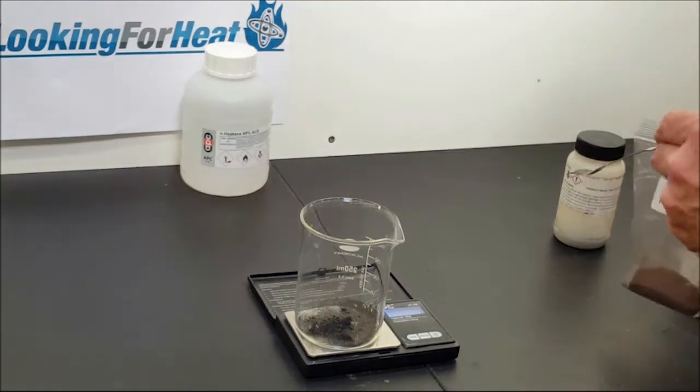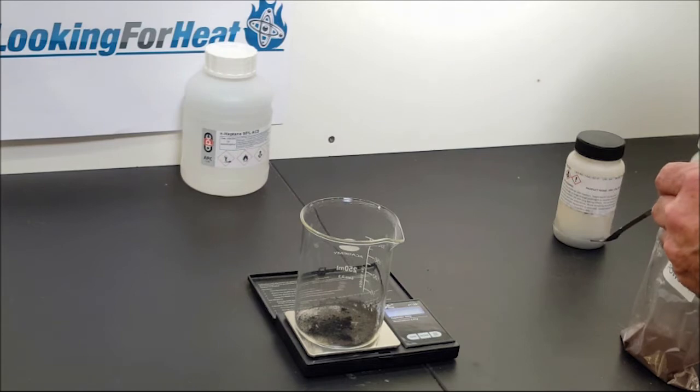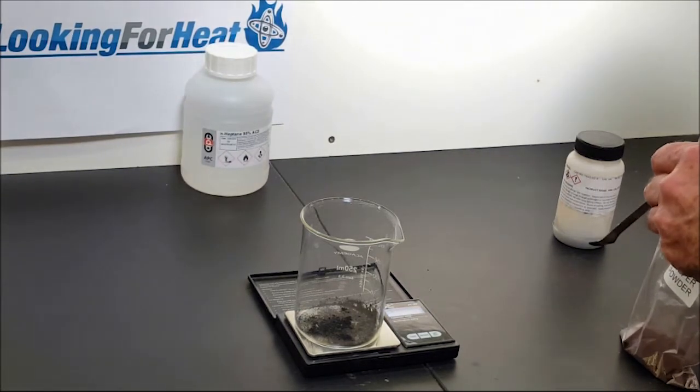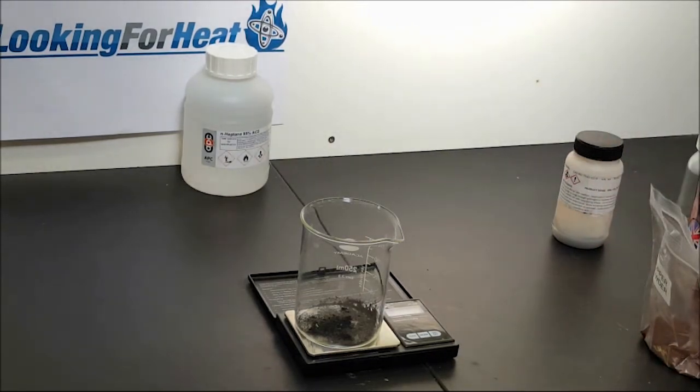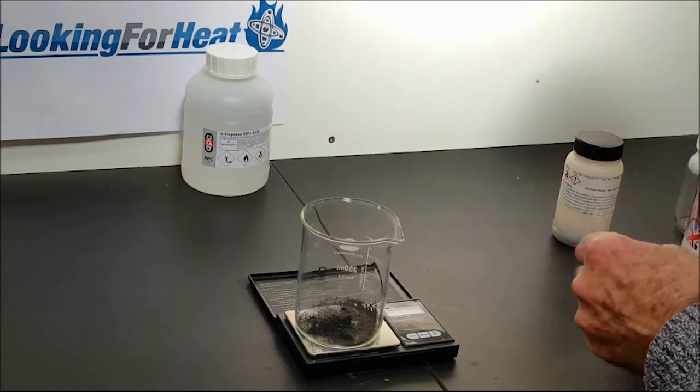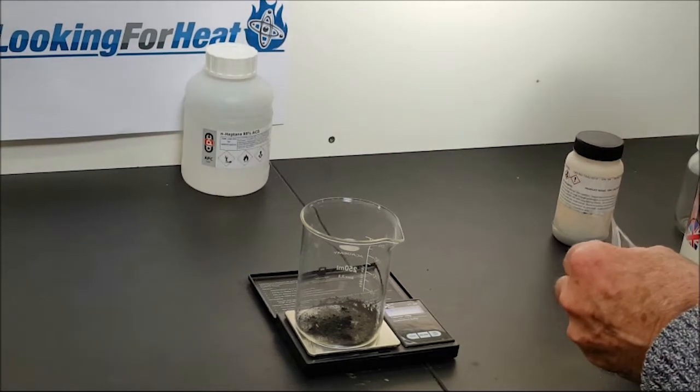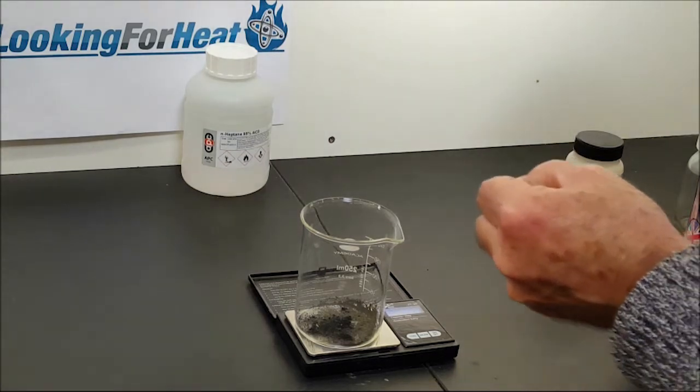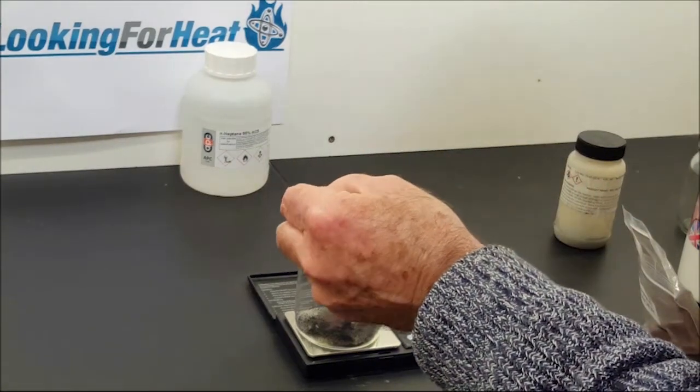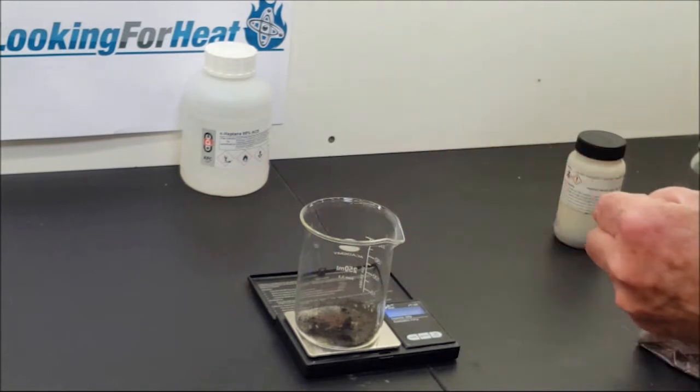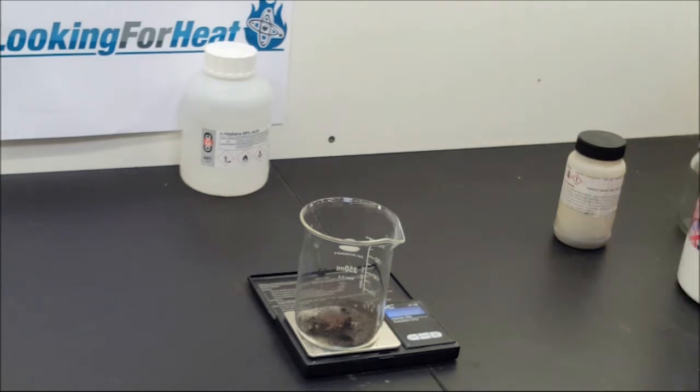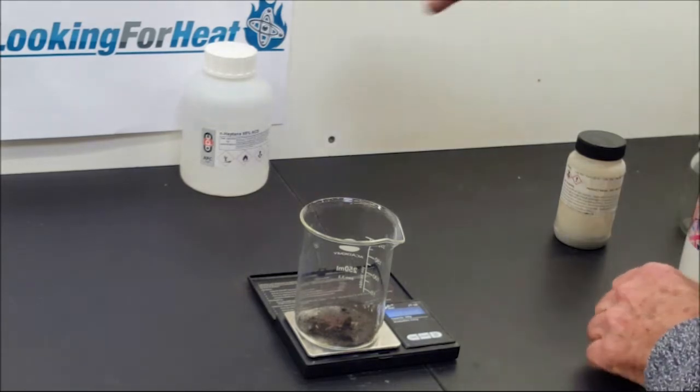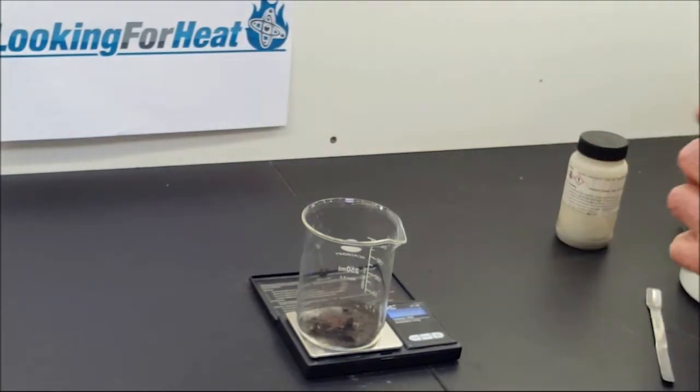The next step, another 0.1 of a gram, this time of copper powder. Copper is used as a spillover catalyst. Some of you may remember that certain Italian gentlemen made excuses for having copper, which involved talking about nickel 62, which may or may not be significant. That's 0.1 of a gram of copper.